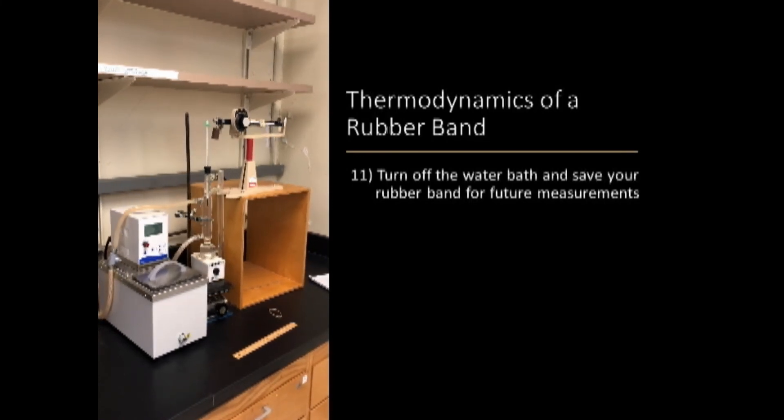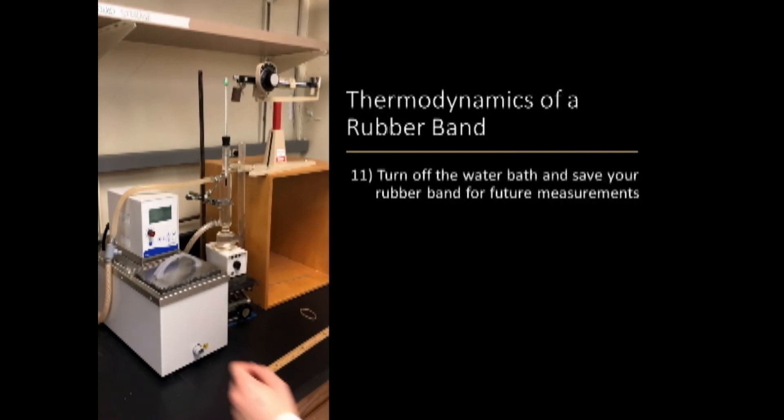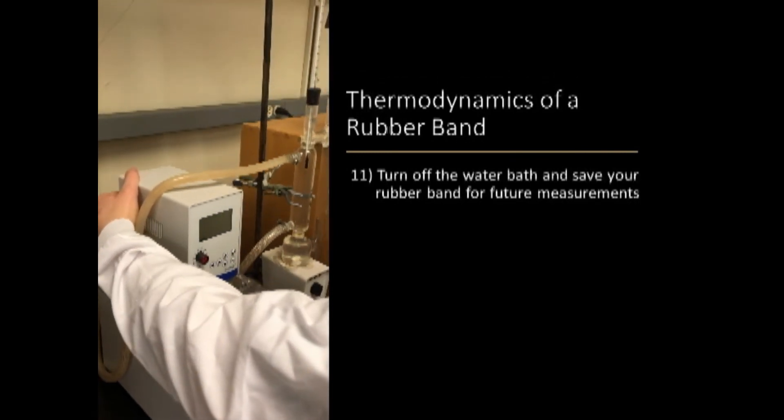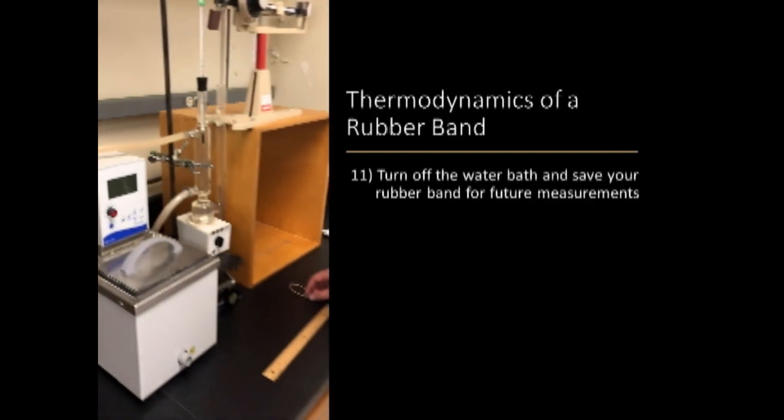When finishing for the day, make sure to turn off the water bath and save your rubber band for future data sets, in addition to making sure to leave your workstation clean.